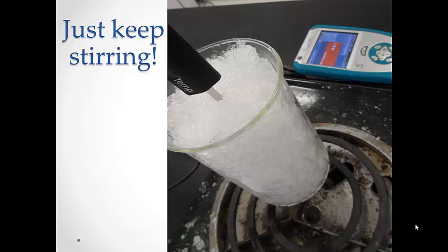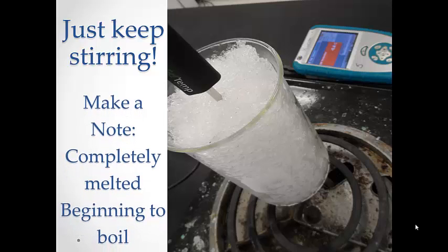You also want to make sure that you are only measuring the temperature of the water. Do not let the temperature probe rest on any part of the glass beaker. Continue heating until the water has boiled for at least five minutes. Make a note of the time and temperature where the ice completely melts and when the liquid begins to boil.